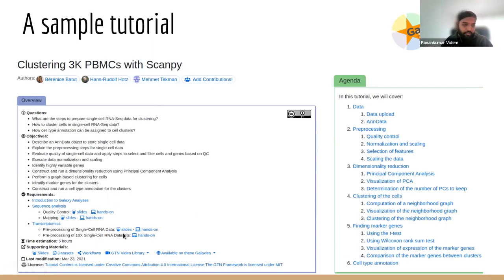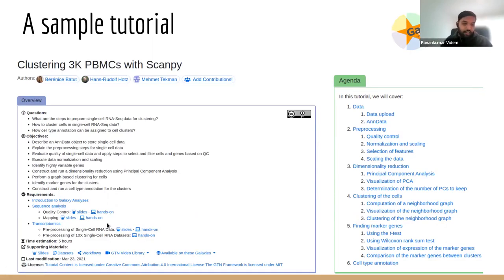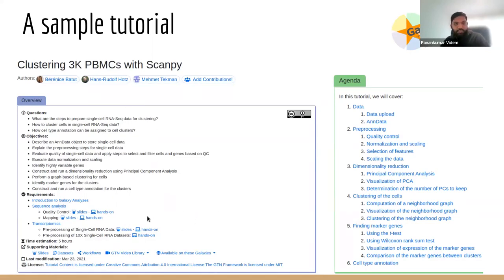In each such tutorial, you have certain objectives — what you will learn by the end of the workflow. You also see your prerequisites before doing this tutorial. For example, you need to know quality control, mapping, and some preprocessing of single-cell RNA data or 10x datasets. You can click on the hands-on links to go back to prerequisite tutorials and continue once you've learned them.